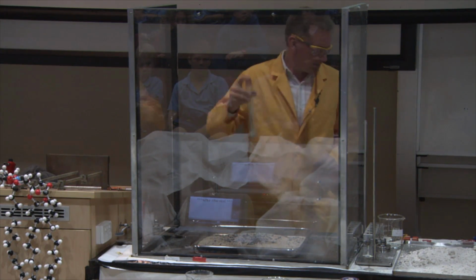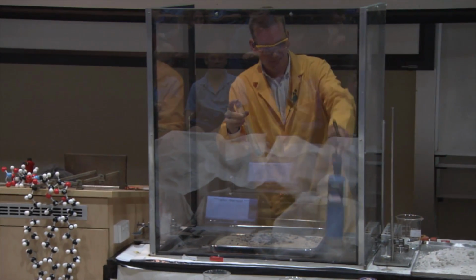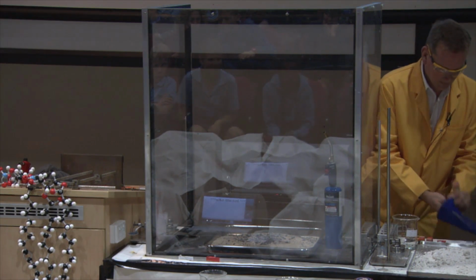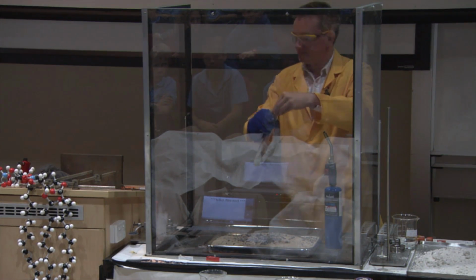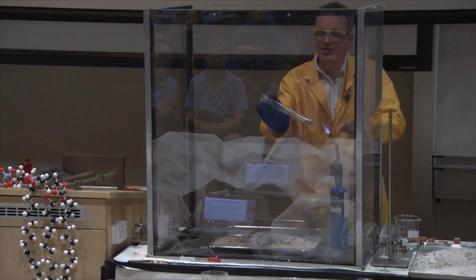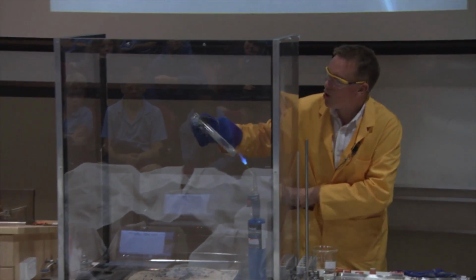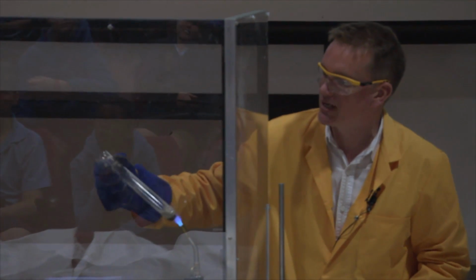Right, and I'm going to heat this up in a moment. So this is my iron mixed up with the sulfur. And I'm going to heat this, and we'll see if we can get a chemical reaction to start. So before we had iron combining with oxygen, now we're going to try iron combining with sulfur.